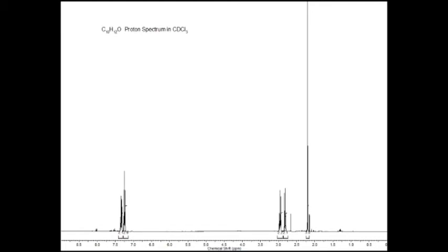There are 7 protons between 2 and 3 ppm, certainly a methyl and the 2 methylenes that we've seen in the DEPT spectra. This is a busy region, 2 to 3 ppm. Protons are not necessarily right next to an oxygen, but they can be near something interesting here. For example, the aromatic ring or even a carbonyl.